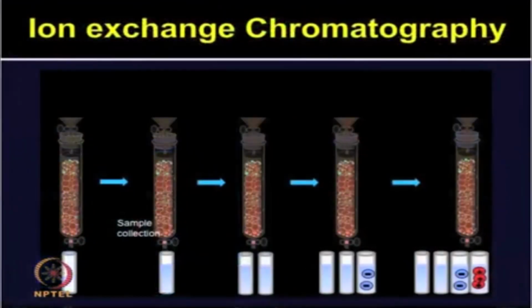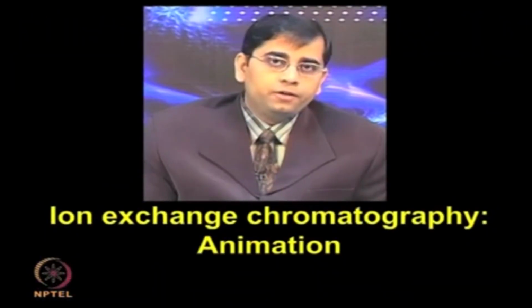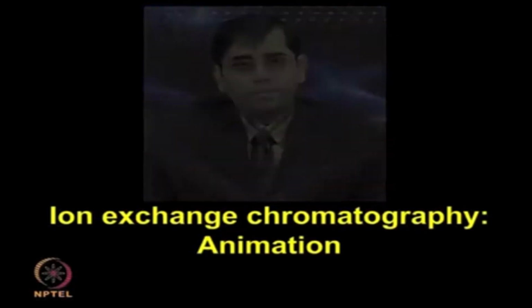So, if you have negatively charged protein which gets eluted first, it will be present in the initial fractions, while the positively charged protein that bound to the column will be eluted in the latter fractions, or it will be vice versa. So, let me describe how ion exchange chromatography works step by step in the following animation.